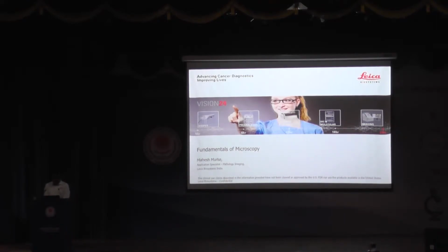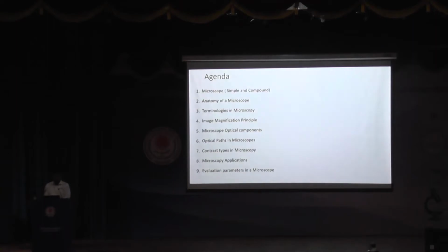With this, I will take ahead this presentation. The agenda is discussing the microscope, the anatomy of microscopes, the optics involved, optical parts in a microscope, different types of contrast, that is bright field, polarization, phase contrast, fluorescence, and applications of microscopy.